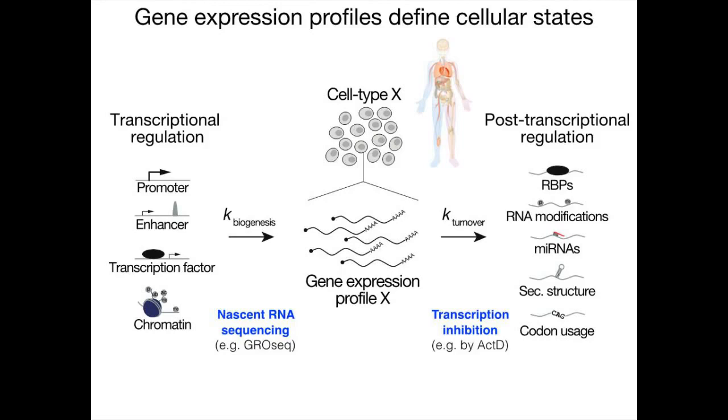Furthermore, inhibiting polymerase II activity compromises cell viability and induces major stress responses, triggering secondary effects, including the selective stabilization of specific transcripts. Now, in principle, metabolic RNA labeling approaches that employ the incorporation of nucleotide analogs enable us to track RNA species over time without interfering with cellular integrity.